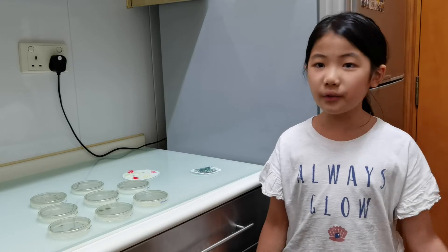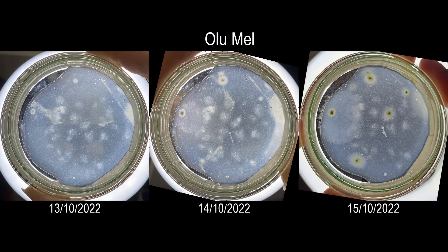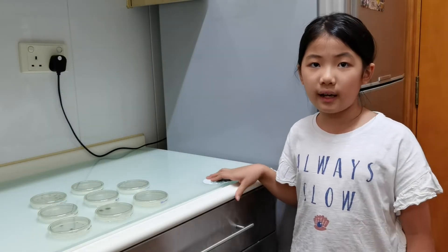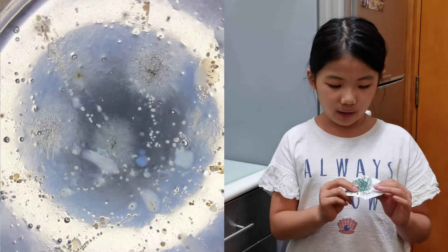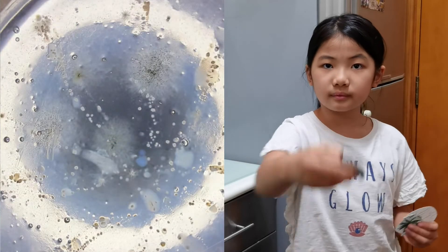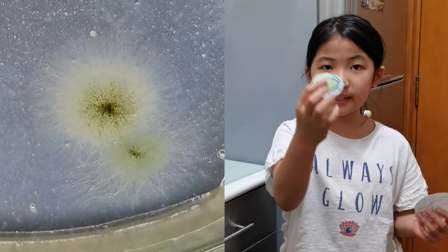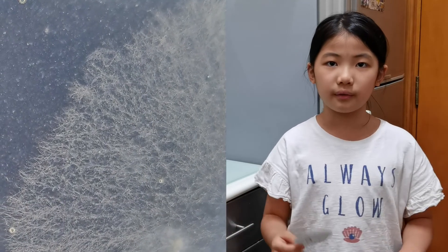For my favorite toy, it has three colonies of bacteria and seven colonies of fungi. In total, I have spotted four different kinds of fungi. One of them is round and hairy. One of them is small but spiky. Another one is a big, dark flower. And one of them is huge like the roots of a tree.